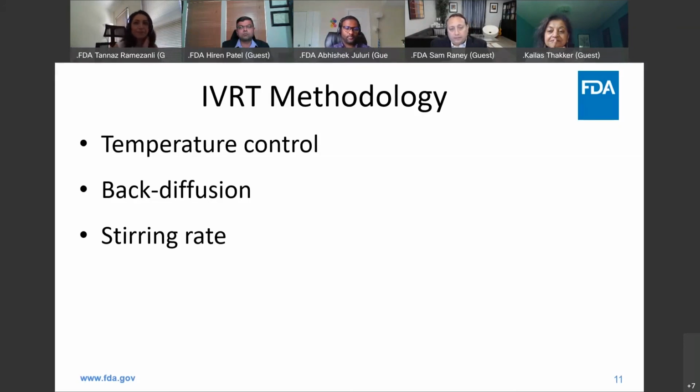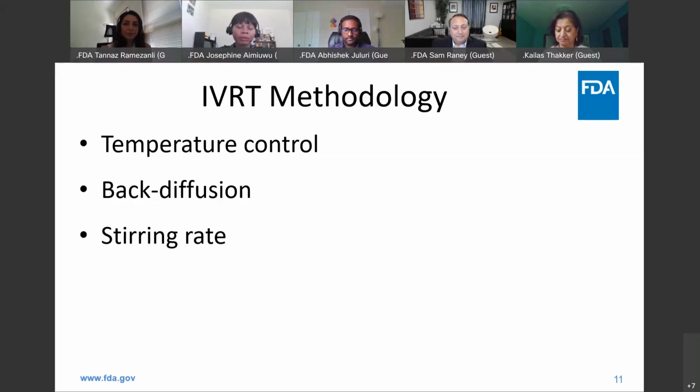And I'm not sure, Josephine or Abhishek or Hiren, if you'd like to comment on that, not even necessarily specifically on the stirring rate, but the broader question of where justifications are sometimes requested. Right. As you said, if things are not clear to us in the way you present your data, and if the proper documentation is not provided in the ANDA, it tends to lead to a little difficulty in following the experiment. So we advise that applicants just provide as much data as possible and explain specifically what they are doing. That way we can follow the train of thought and be able to assess it appropriately.